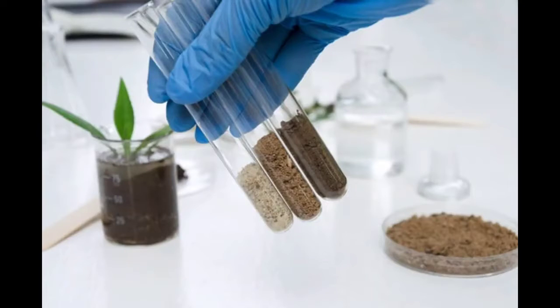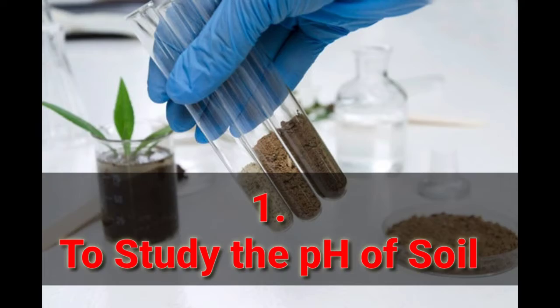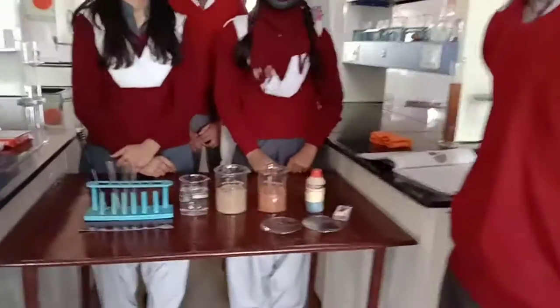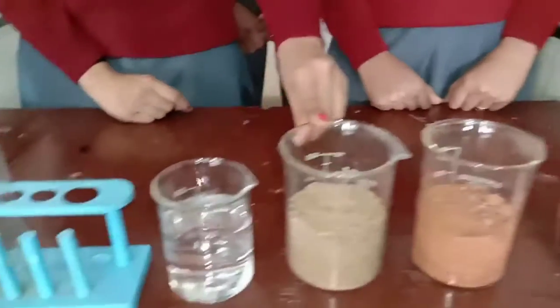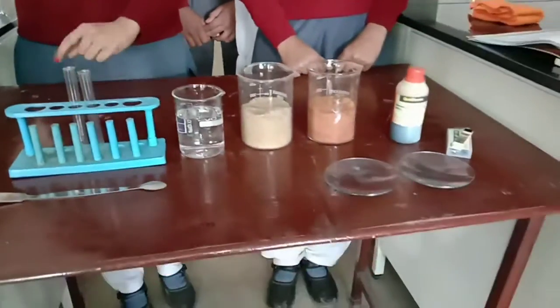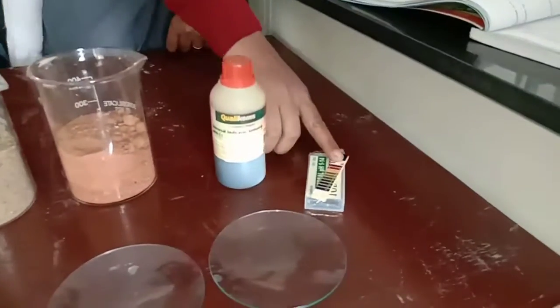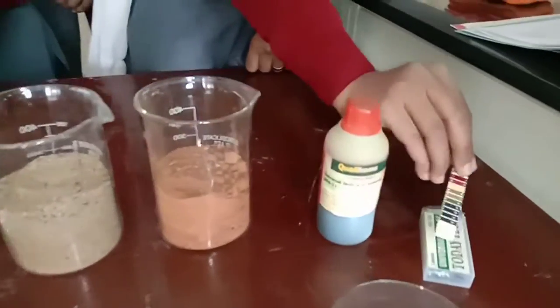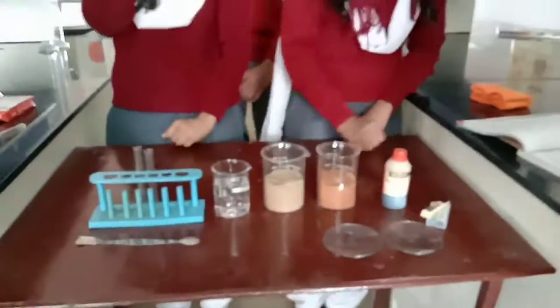Okay dear students, now it's time for the second experiment. Aim: to study pH of different types of soil. Now the requirements of materials for this experiment. We require a soil sample, beaker filled with water, test tube, spatula, pH paper, universal indicator solution, and watch glass.